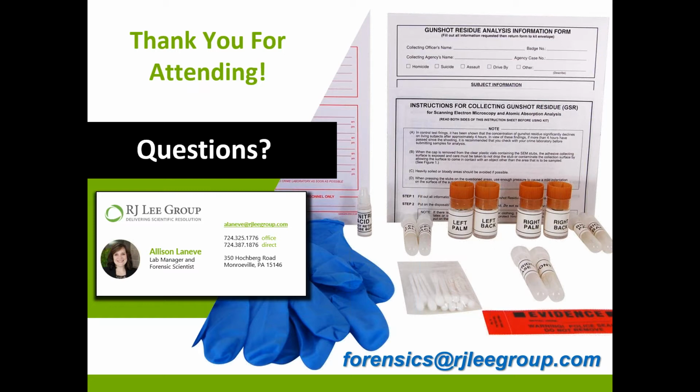Is RJ Lee Group accredited for GSR? Yes. RJ Lee Group is an accredited laboratory. We are accredited by ANAB, and we are accredited for primer gunshot residue analysis as well as distance determination.